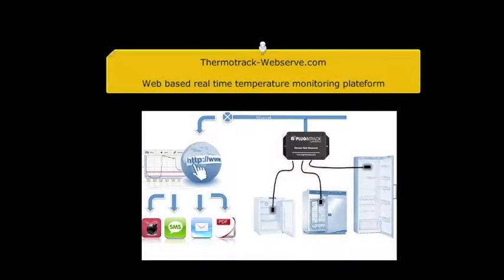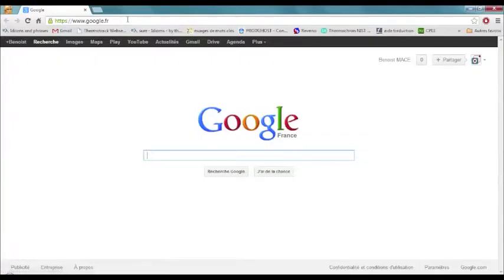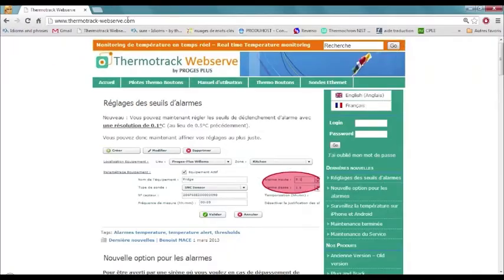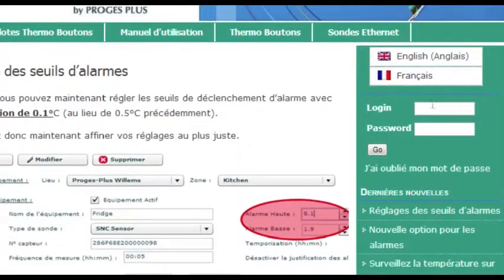Let's see how quick and easy you can set your real-time monitoring system with thermotrackwebserve.com. Go to www.thermotrack-webserve.com and enter your login and password.